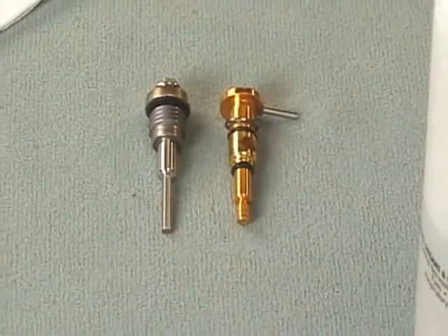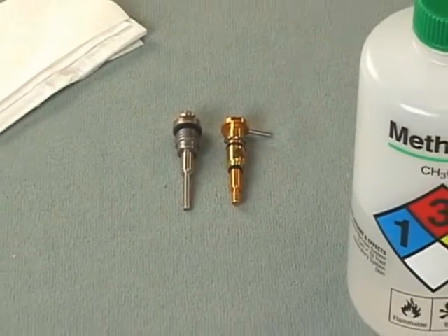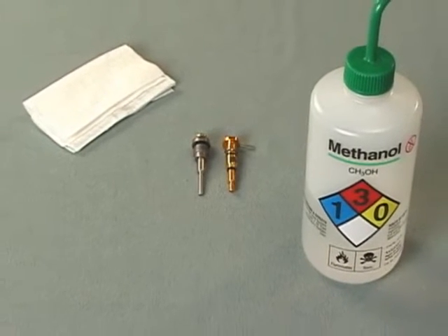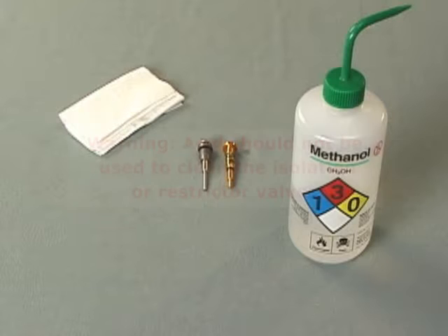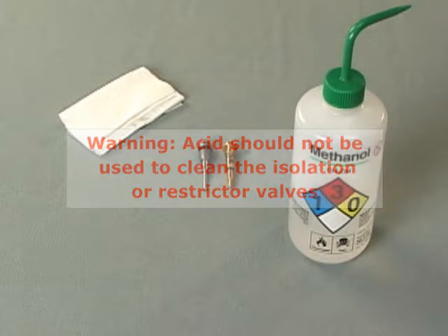Both the isolation valve stem and the restrictor valve may be cleaned by wiping with a lint-free cloth wetted with methanol. If necessary, use a glass fiber pen to gently remove deposits from the isolation valve stem, and then place the stem in a vessel containing 50-50 methanol water and ultrasonicate it for 20 minutes. The use of acid for cleaning these components is not recommended.